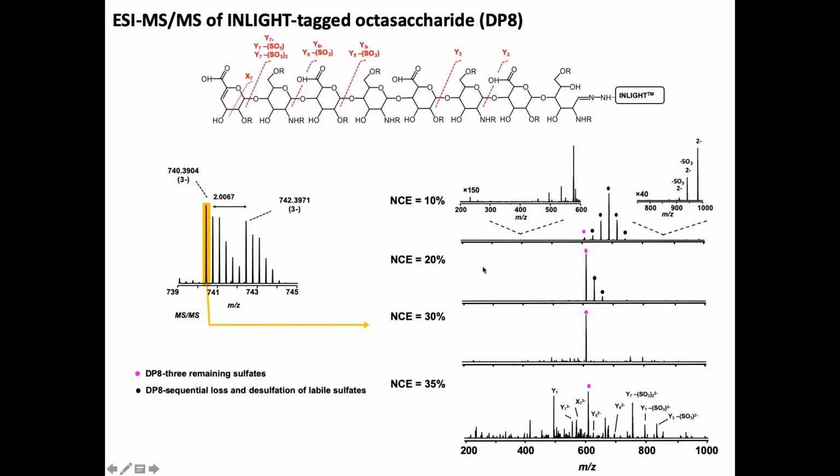So with this, I can now do higher molecular weight oligomers, okay? So this is a DP8 that you can buy a standard for. Again, this has all been tagged. So you can actually tag it, mix it together, 1 to 1, from a method development or a theoretical standpoint.